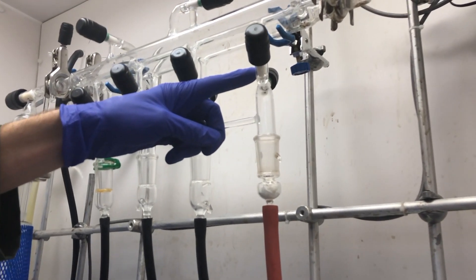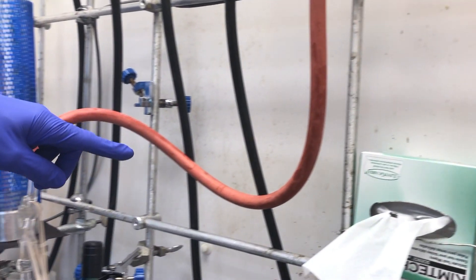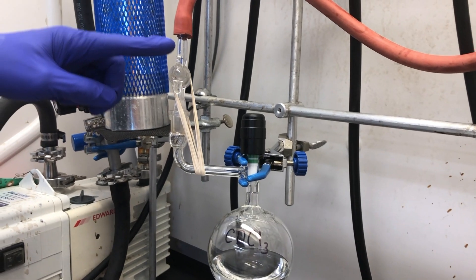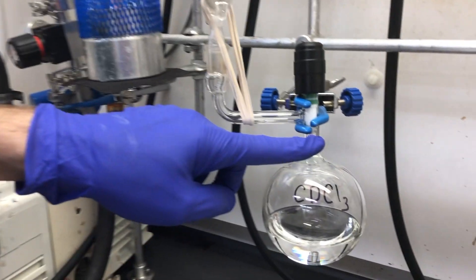As you can see, we have three places that can be open or closed to introduce vacuum into the system. Mitch has opened the front vacuum tab at the manifold, and the glass stopper on the hose adapter is also open. However, the Teflon stopper is still closed at this point.